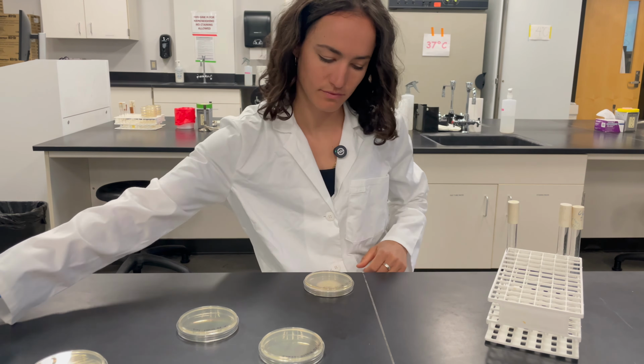They'll stay in the incubator for about 48 hours. Just note that incubation times will vary depending on your goal and what microbes you're trying to culture. For our purposes, that's the incubation sweet spot. So once we've hit that mark, they're transferred to the refrigerator, which will slow down growth and preserve the samples for a few days or just until we're ready to look at them.